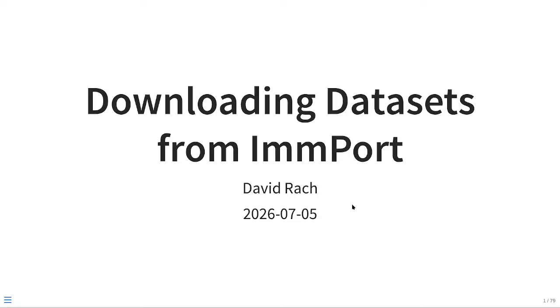So it's a little bit different from what we are normally experiencing. We're giving this format a little bit of a try. We'll see how it goes as we move forward.